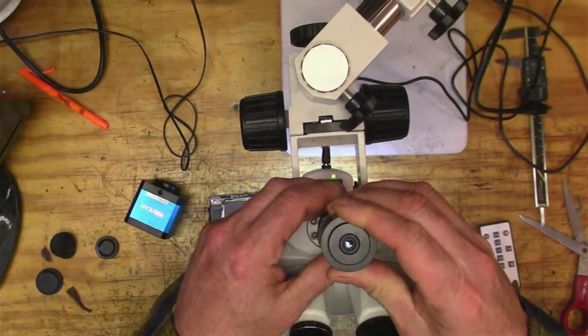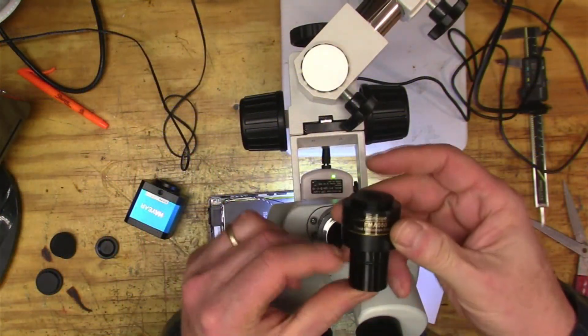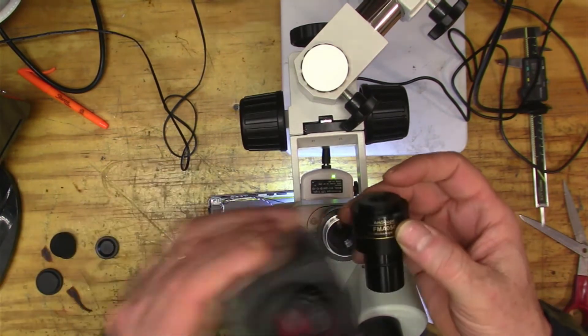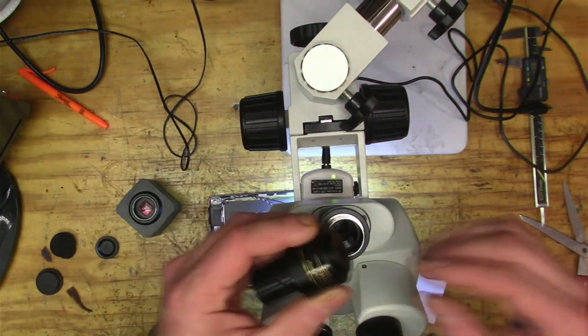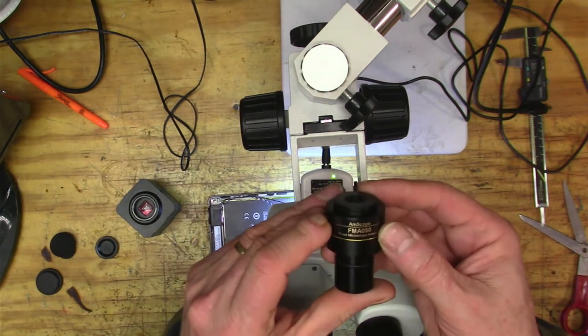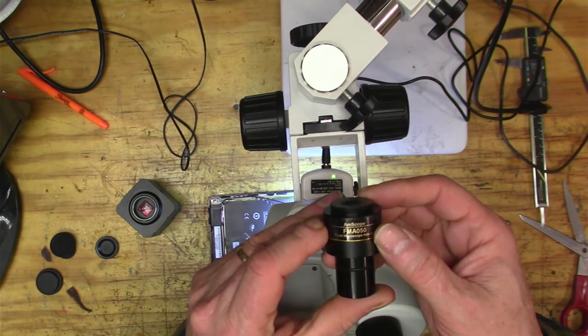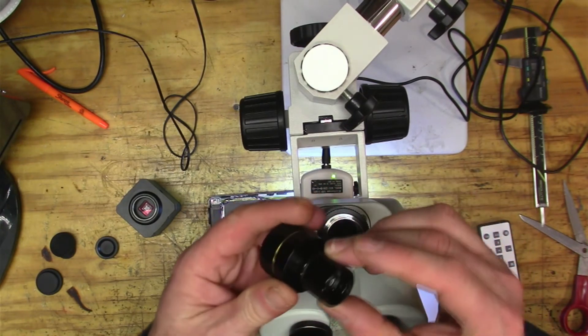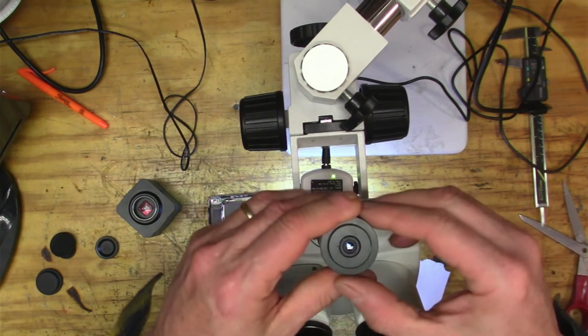So here's the part that I got to kind of connect the camera with the type C mount. So this is an Amscope FMA050, and it has a 0.5 magnification.